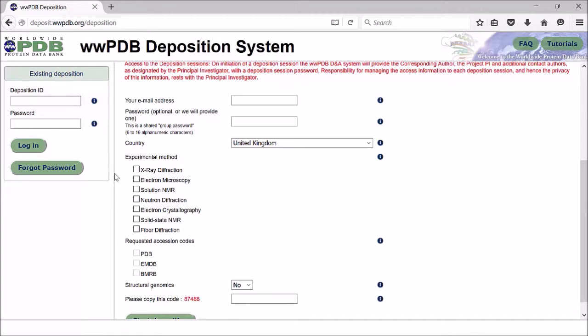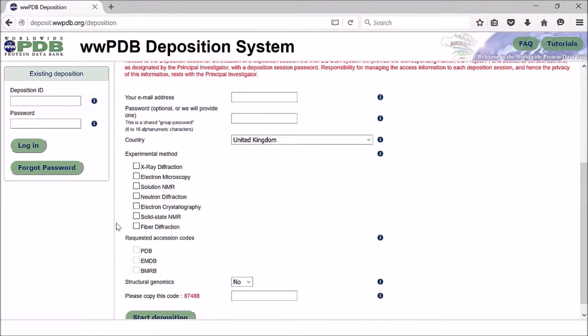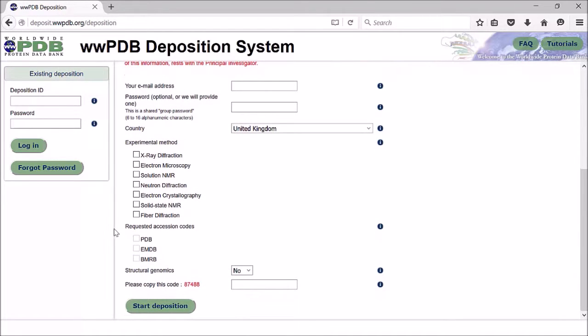You can then select your experimental method, and there is also a selection of accession codes you can request depending on what you are depositing. A structural model for the Protein Data Bank would require a PDB accession code.